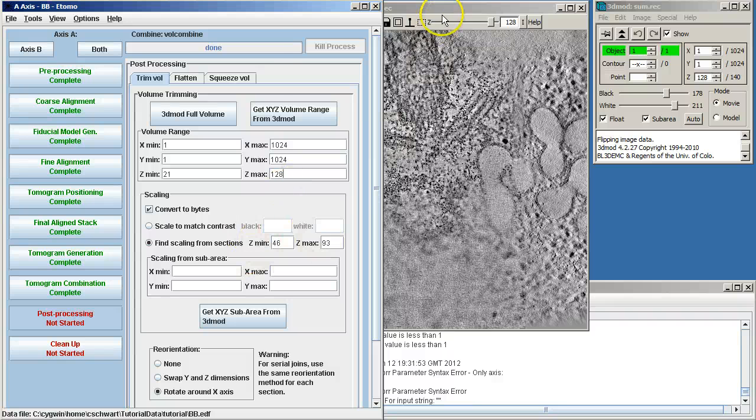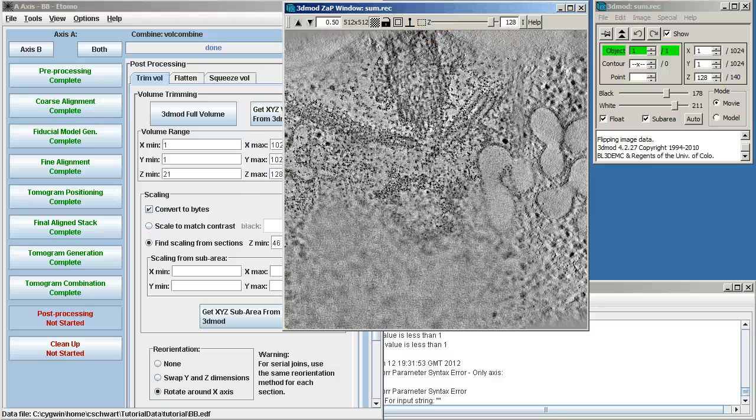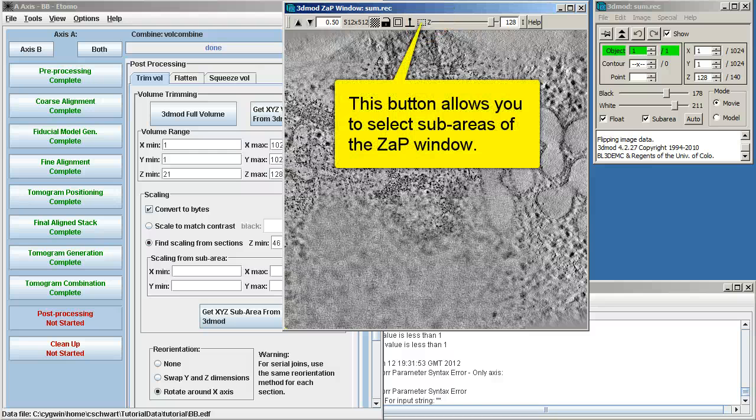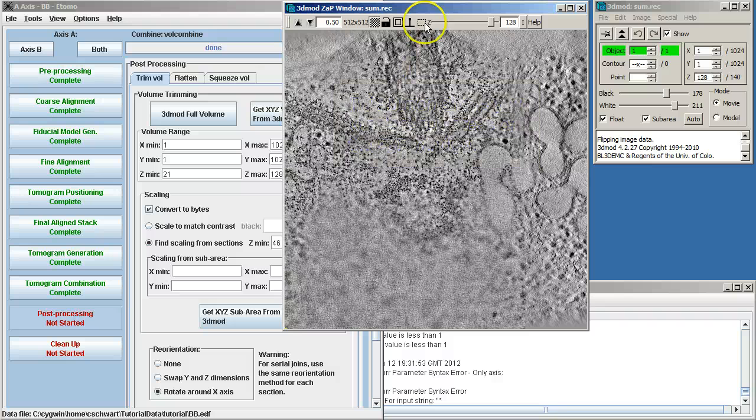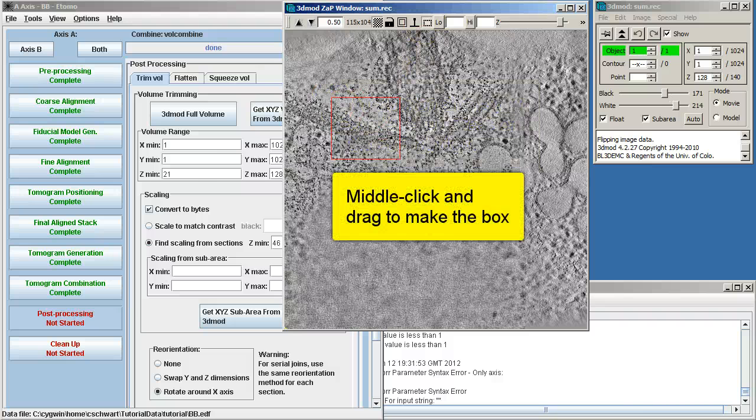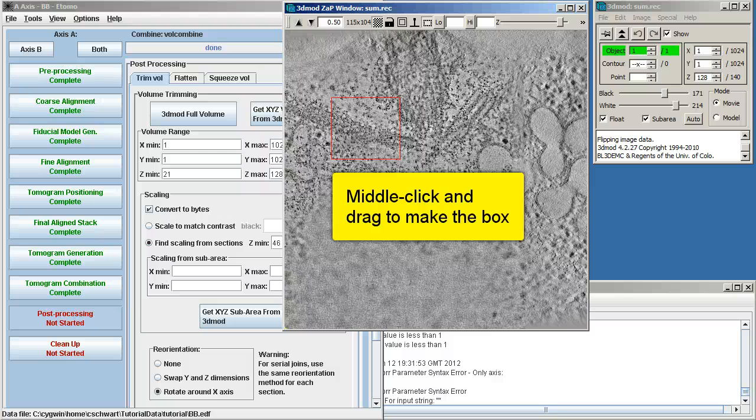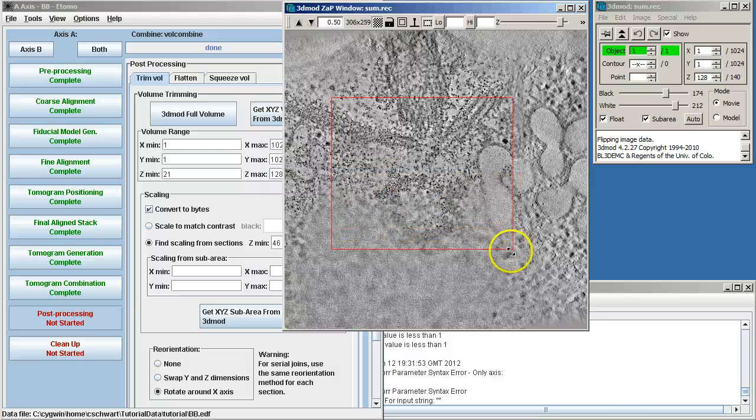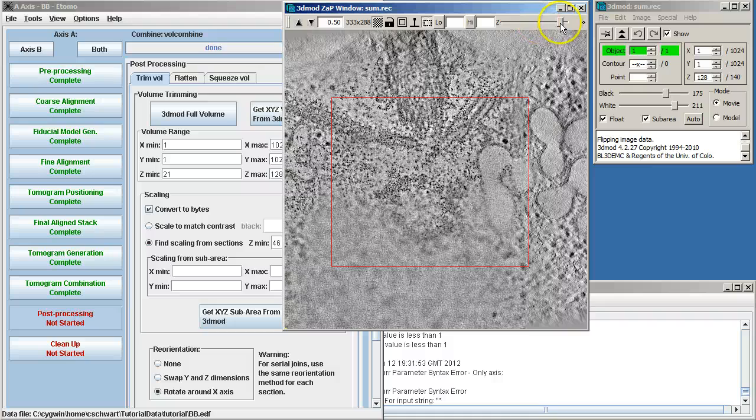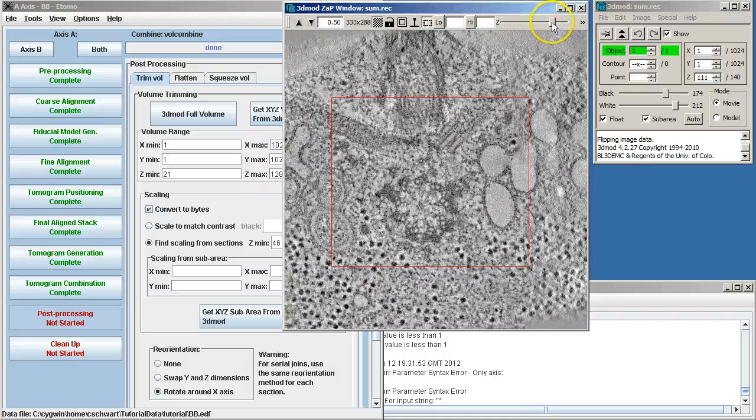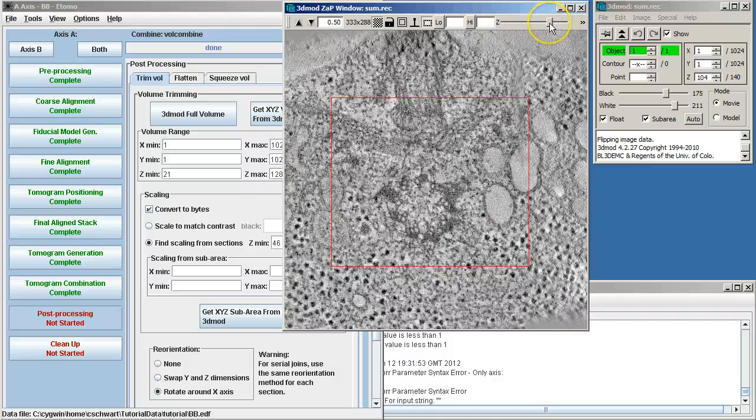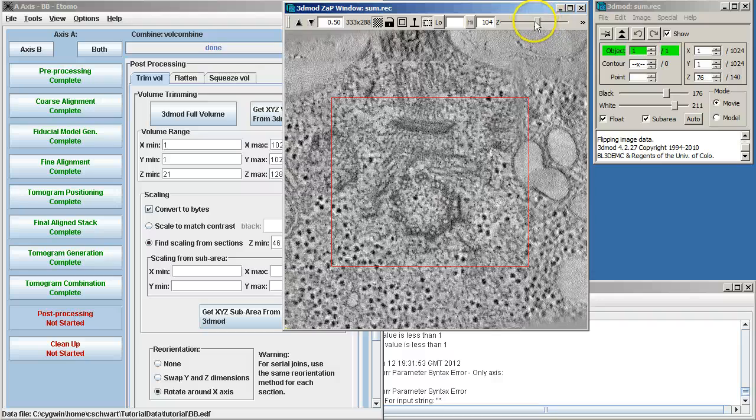And now I have to do scaling. So here I'm going to use what we call the rubber band tool. This allows us to select sub areas in the zap window. I just click on that, and then if I middle click and drag, I can make a box on top of the cellular material. Then using the slider, select a Z where I'm inside the cell. That's my high.